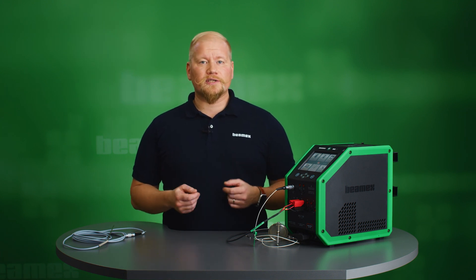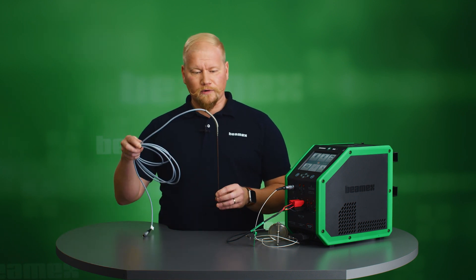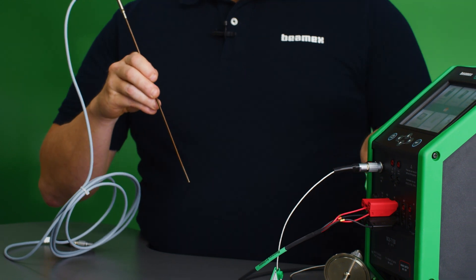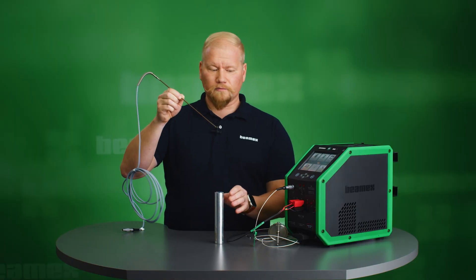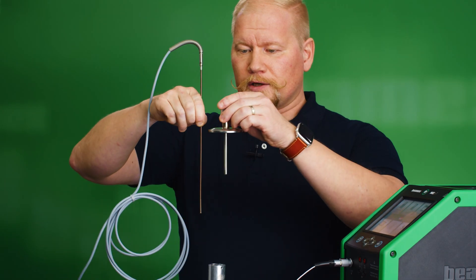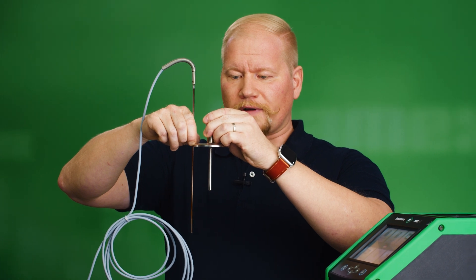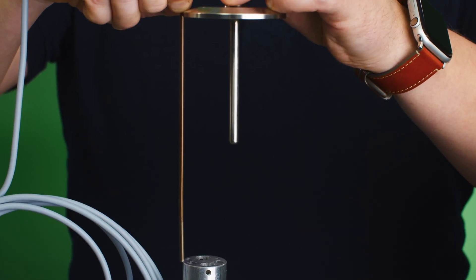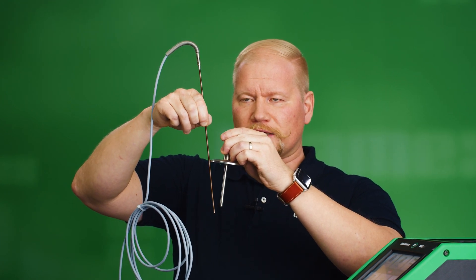When doing calibrations for short sanitary sensors, there are a few challenges that need to be overcome. Starting from the reference sensor point of view — here's one of my references. This model has a fairly long stem, and if I place it into my insert, I see that my immersion depth is about this much. Comparing it to my short sanitary sensor, the tips are on different levels, meaning they're not going to measure correctly. There's too much uncertainty — I need my reference at the same depth as the sensor being calibrated, and preferably as close to it as possible.